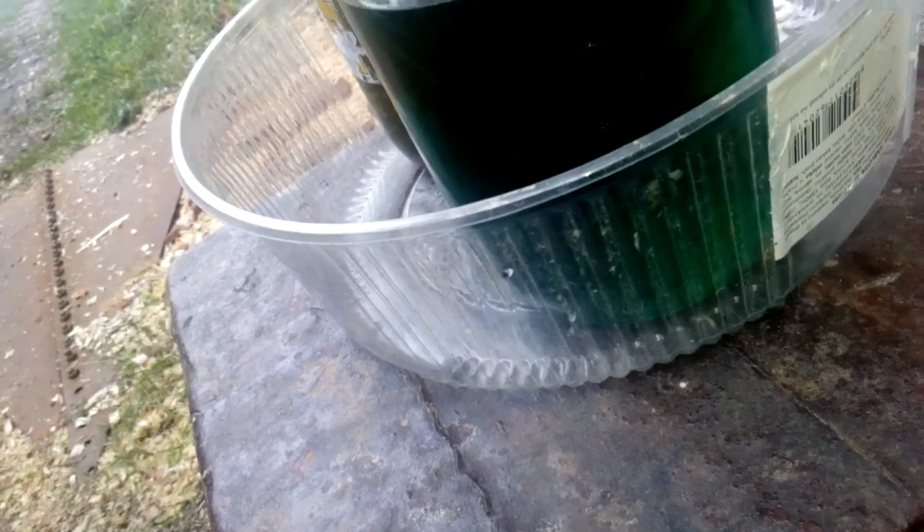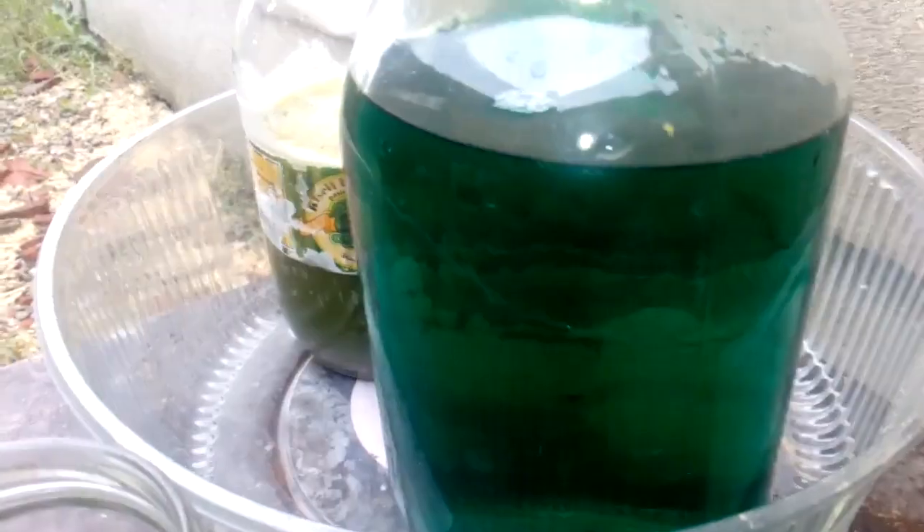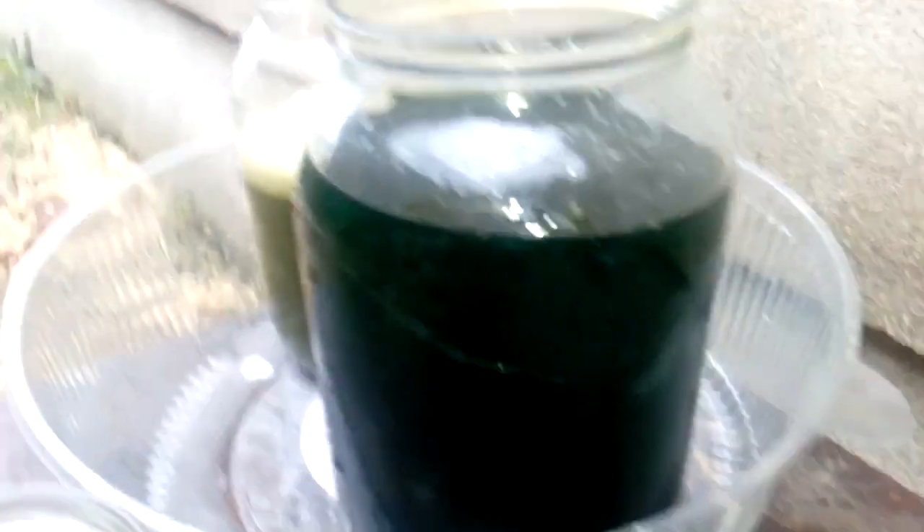I have here a mix of 50-50 distilled water and hydrochloric acid, with 10 grams of SMB dissolved in it. So let's drop some gold. After a couple of minutes we got some color change — it went dark — and now we leave that to settle down.